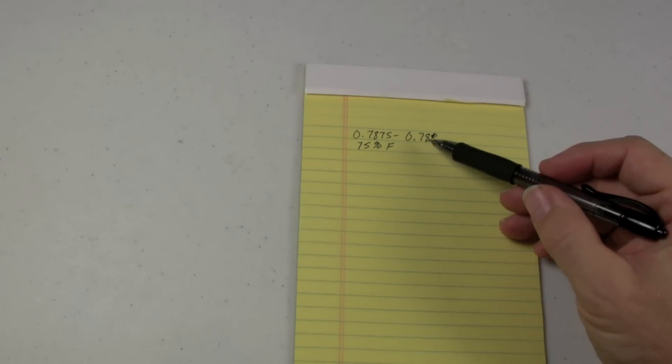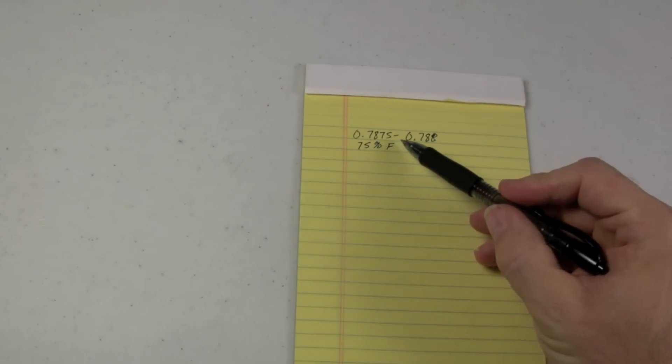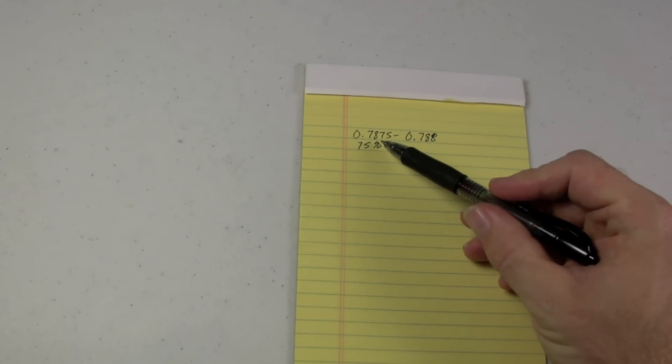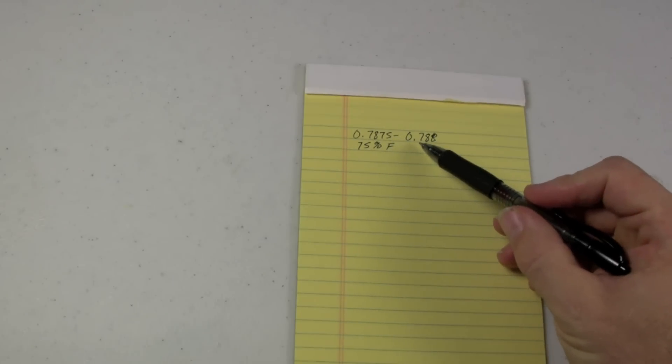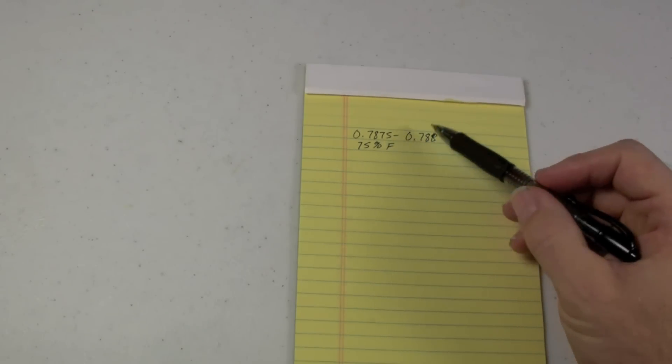Okay, when we took our reading, it was 75 degrees Fahrenheit, and the reading on the hydrometer was .7875 to .788. So it's somewhere in that range.